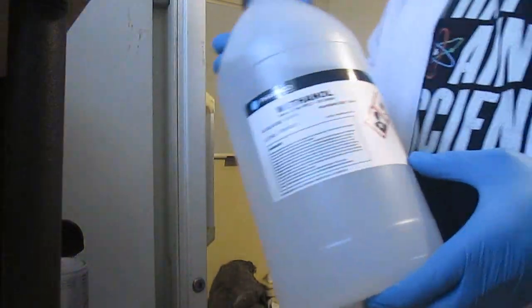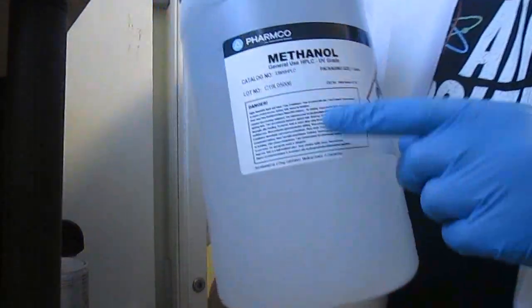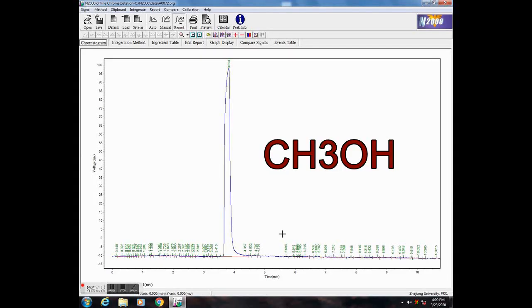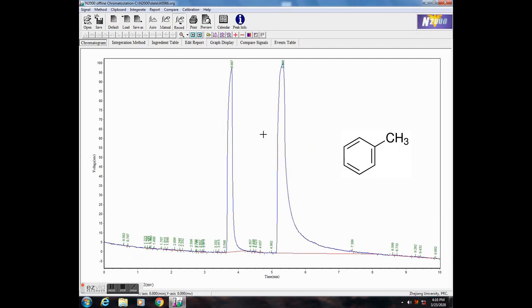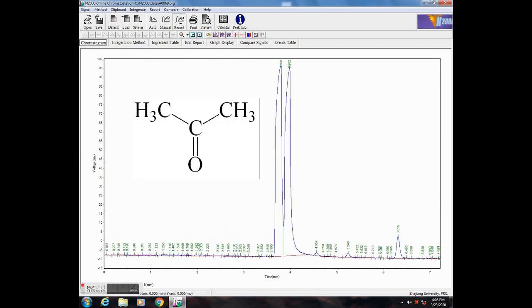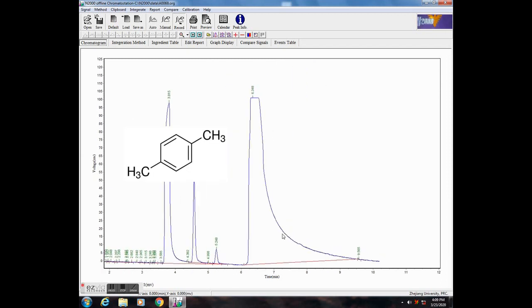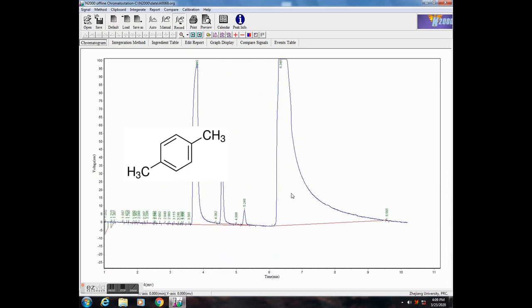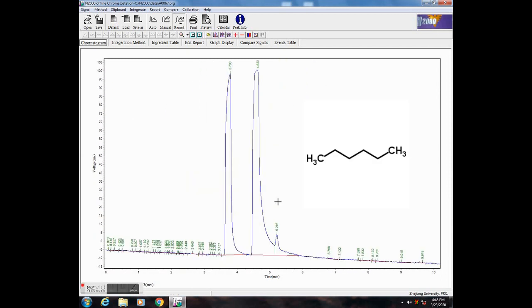Here's the methanol I've been using for dilution — you can see how clean it is. Here's a toluene, here is acetone, here's p-xylene with the toluene contamination, and this is a hexane.